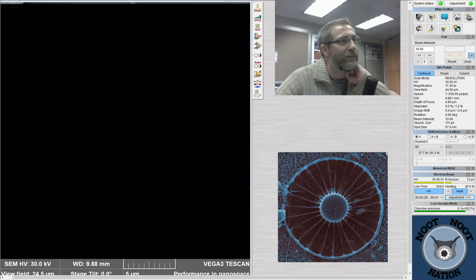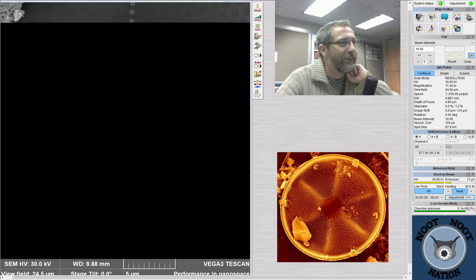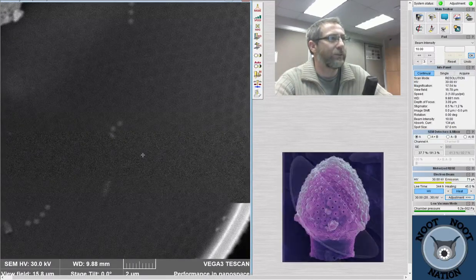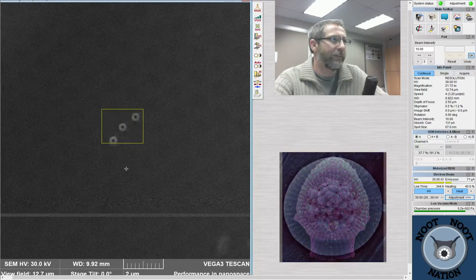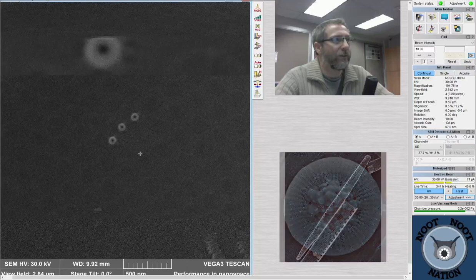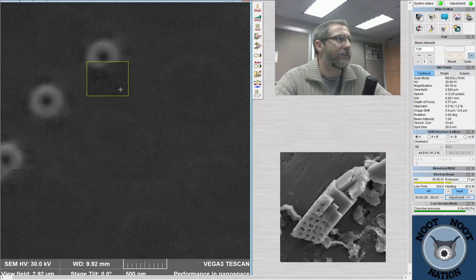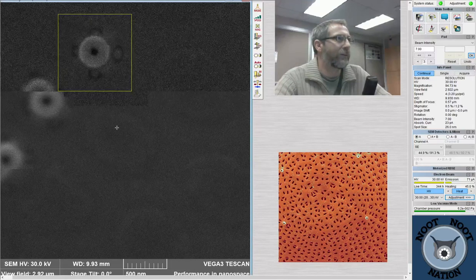And while it's doing that, I can kind of jump over and see how things are going in the channel. So I'm working on the enhancement part right now. As you can see, the character of this sort of view changes a little when you switch the accelerating voltage. And the reason for that is, and I don't often play with accelerating voltage when I'm running streams, that the stronger the accelerating voltage, the more sort of deeply the beam will penetrate. And sometimes I want to just capture the surface. Sometimes I want it to be a little bit more sort of a depth into the material, and the accelerating voltage is the primary way that we would sort of adjust for that.